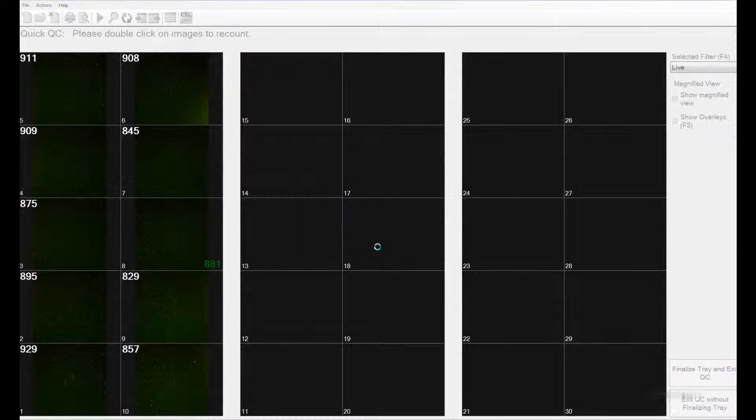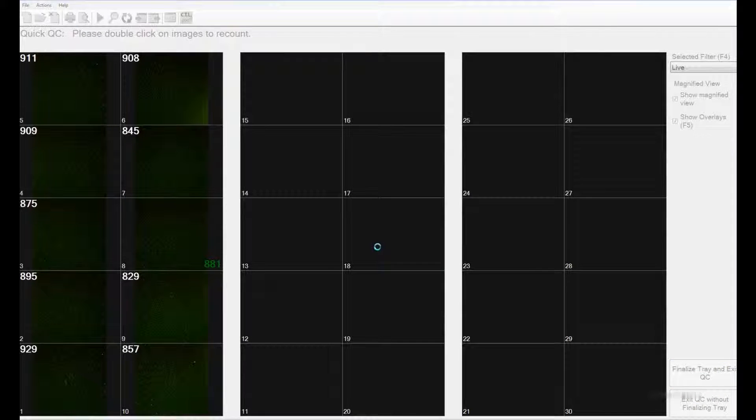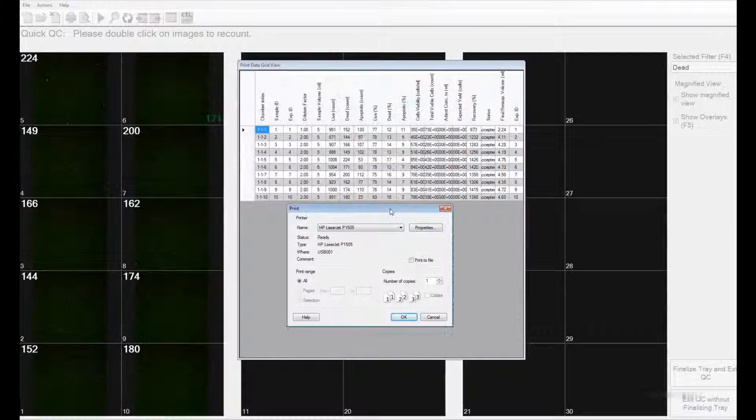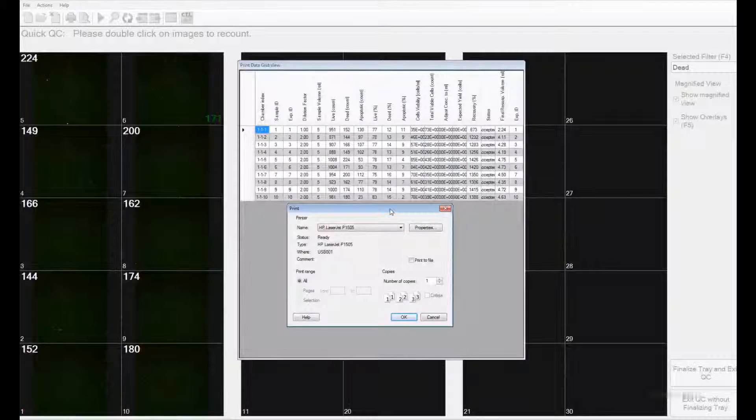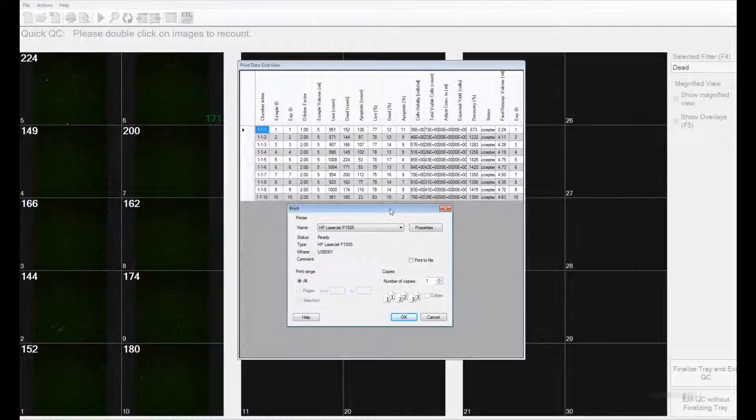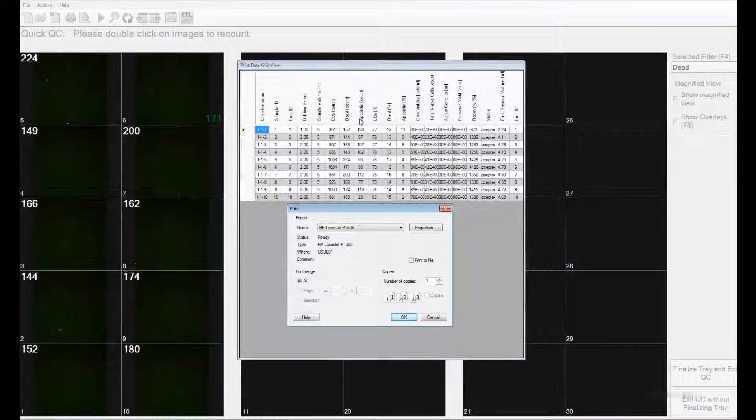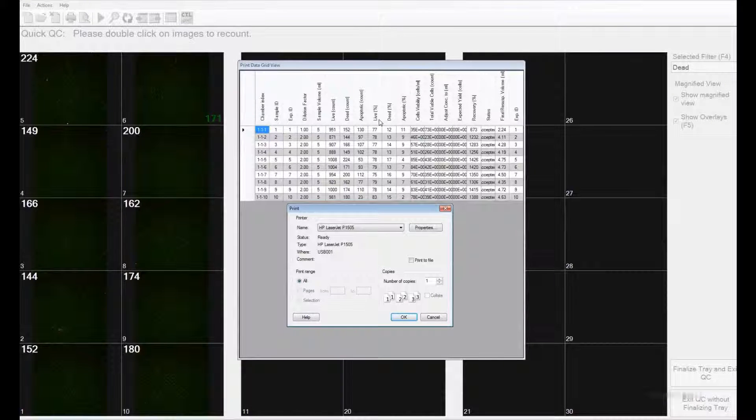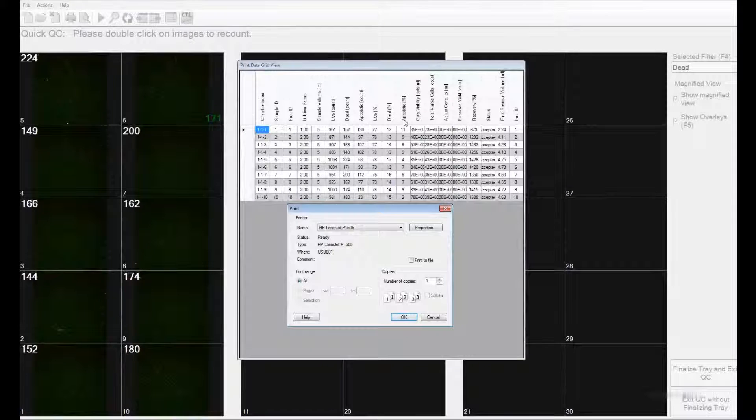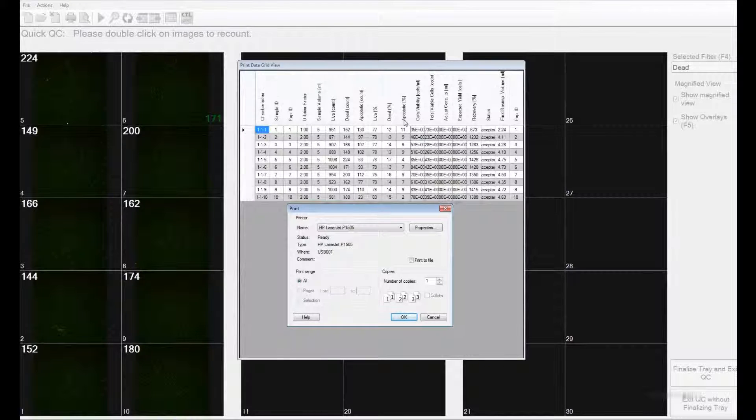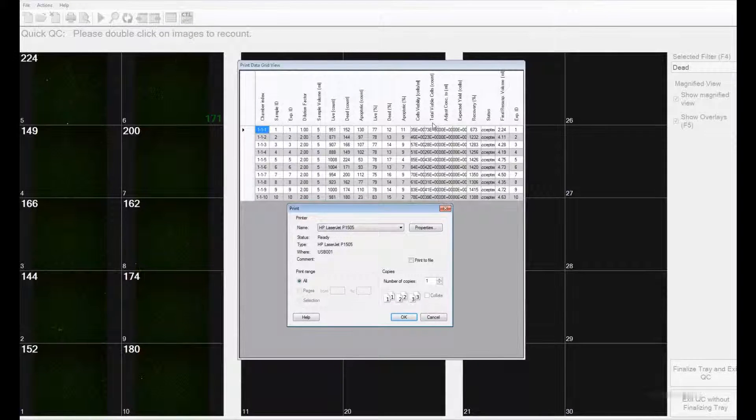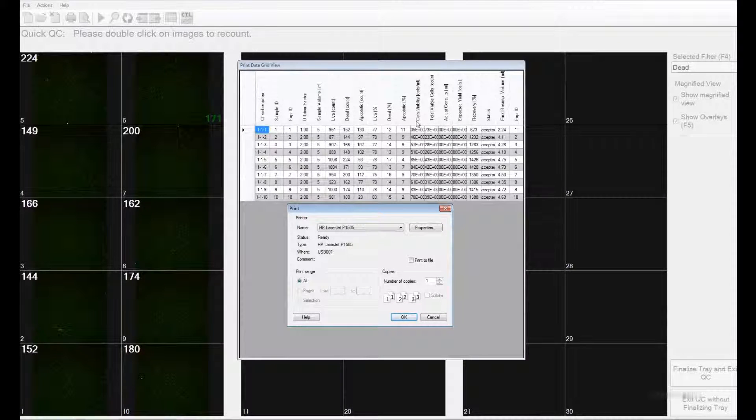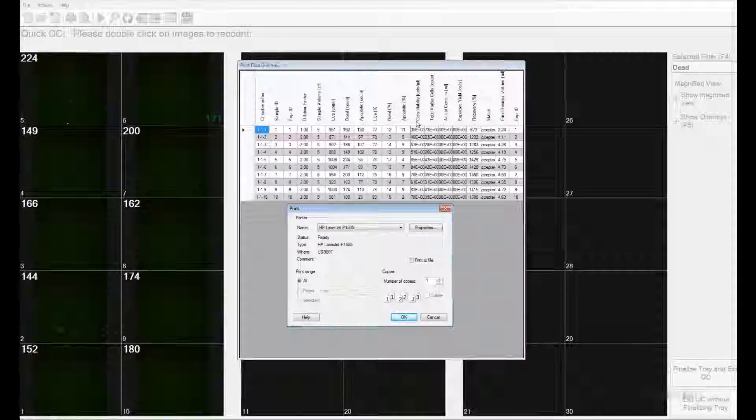Once you confirm this, you can print the data set right there. The printed version gives details on the live, dead, and apoptotic count, the live, dead, and apoptotic percentages, as well as the total viable cell count and the concentration.